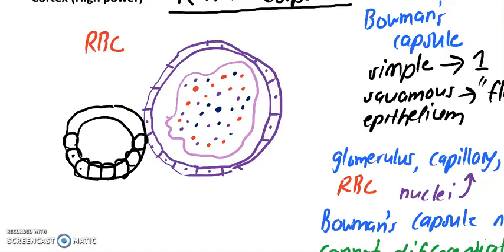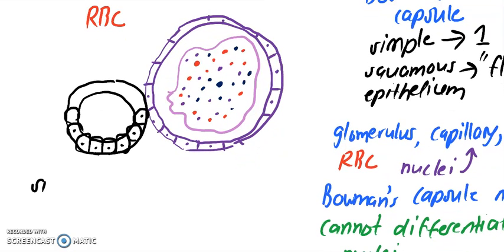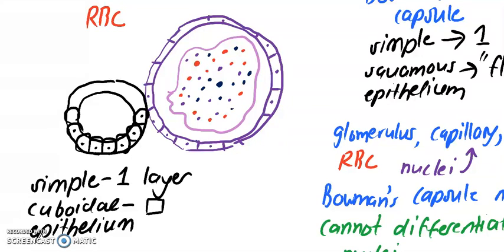And again, just like most cells, you will expect to find a nucleus. So to help us differentiate it, we call this new cell type simple cuboidal epithelium. Simple refers to the fact that it's only 1 layer thick. Cuboidal because they are square-shaped in 2 dimensions, but in reality in 3 dimensions they are cubes.